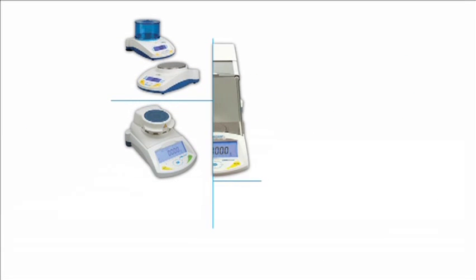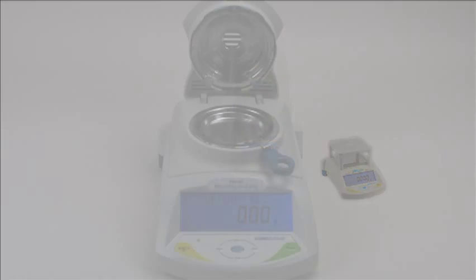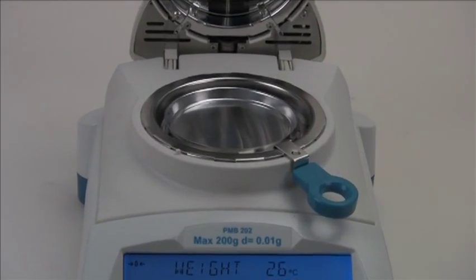Welcome to Adam Equipment's video training series. This video will provide an overview of Adam's moisture analyzers, the PMB series. Both Adam moisture analyzers offer the same features and operation for simple and fast moisture determination.